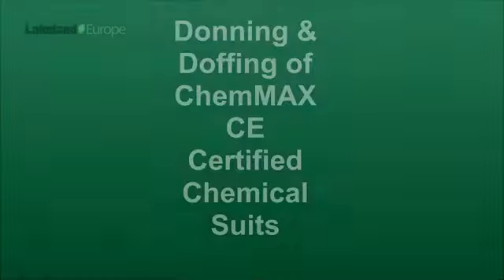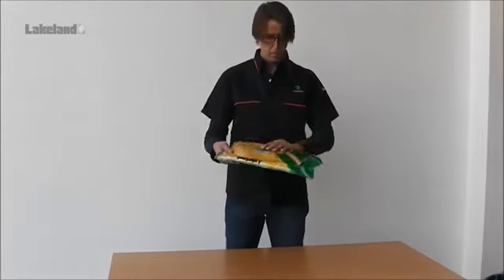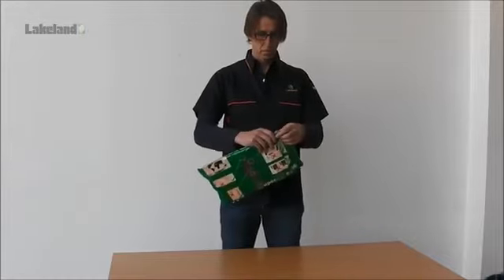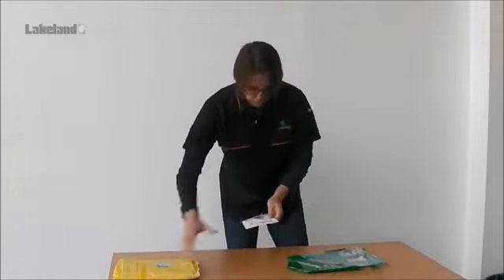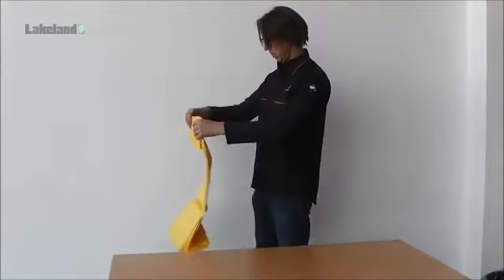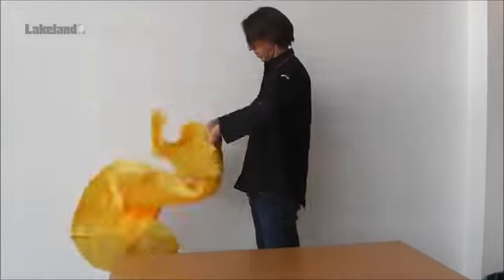Our sales manager in Belgium, Steven Dedecker, uses the Chemmax 1 coverall to demonstrate. It is important to ensure that the garment is not damaged before use, so first examine the packaging. Tear open the bag from the nick at the top and carefully remove the garment. The user instructions supplied provide a good guide on the certification, usage and do's and don'ts of using coveralls.